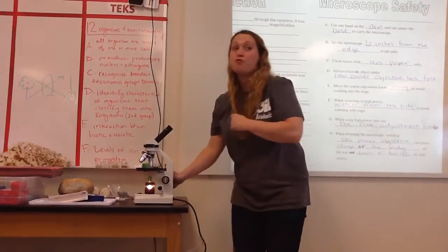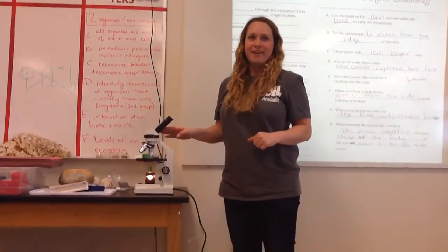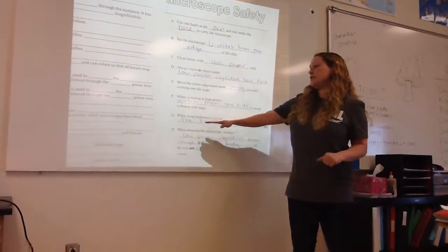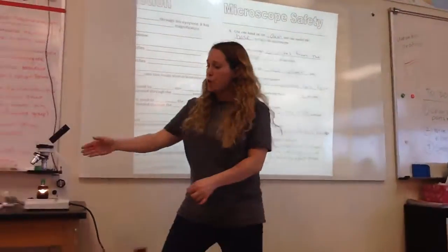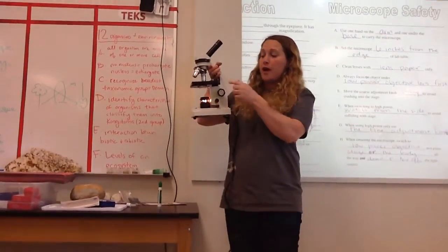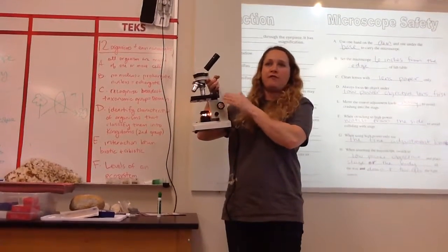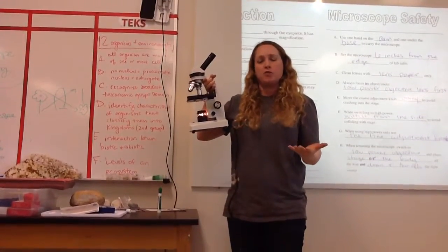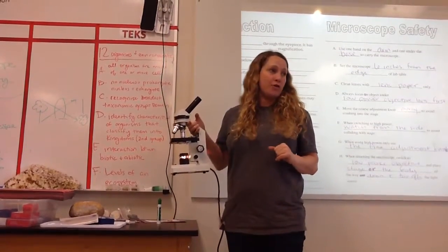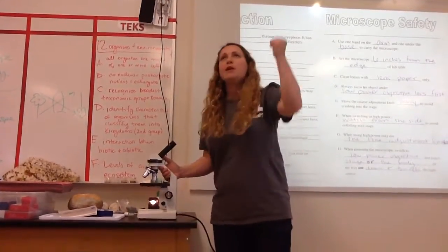Ooh, and now I'm really, really close. It's pretty amazing, okay? You excited to look? It's gonna be cool. Okay, so when you're using the highest power, they recommend you only use the tiny knob because now you're so close that this knob moves it too much, okay? So you may have to figure out which one works for you when you're in the situation, but always if you're going to move closer, you take your eye away and make sure it doesn't crash. That is the most important thing. Think you can handle that? Yes. I believe in you.